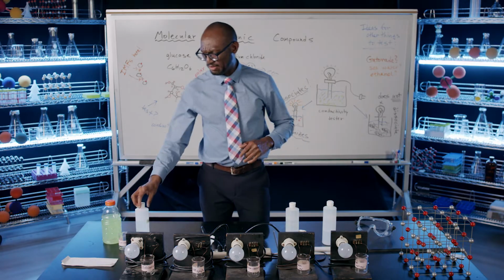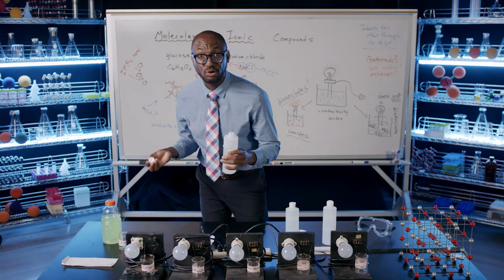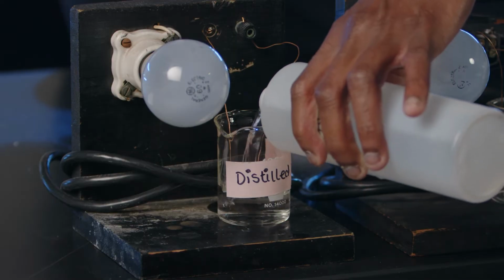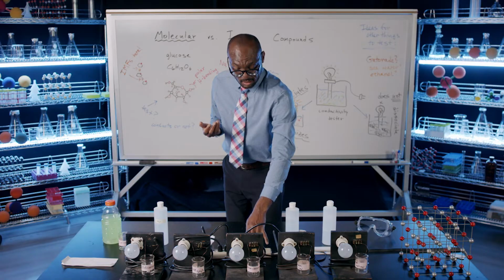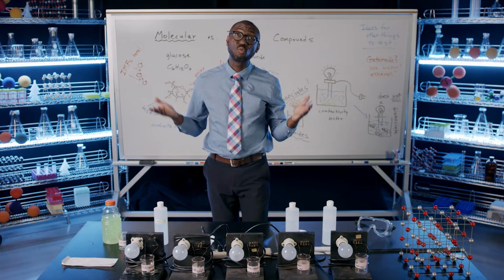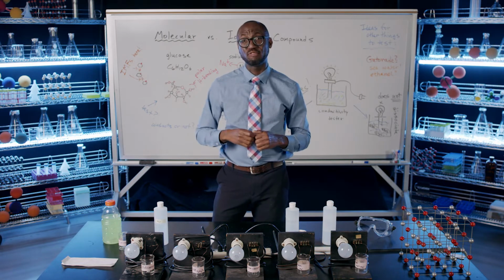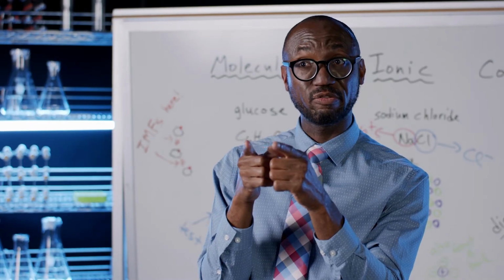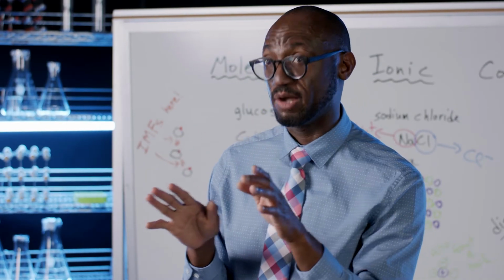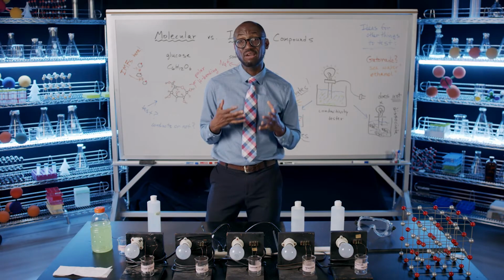First, let's just test some water. If I submerge the electrodes in a beaker of deionized water, let's see what happens. Ooh, the bulb does not light. Well, that's because water does not conduct electricity very well, at least not well enough to light this bulb. But in the movies, they are right. You do not want to be in a pool when lightning strikes. Stay away.